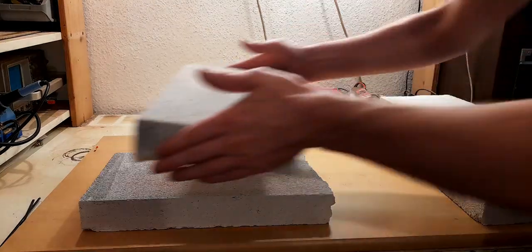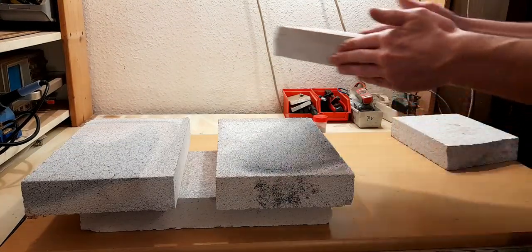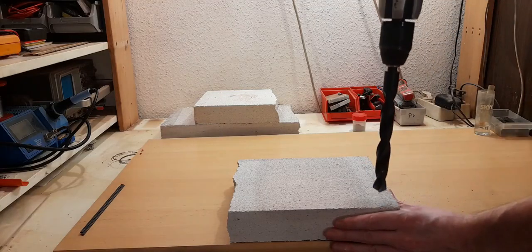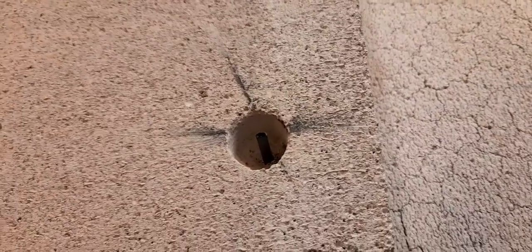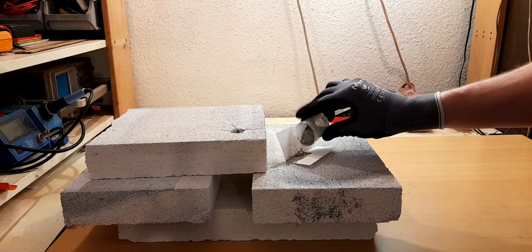I stacked some fire bricks to protect my workbench and make a makeshift furnace. Next we create a small mold to keep the loose powder from flying away. Here you can see the graphite electrode in the middle of our mold.